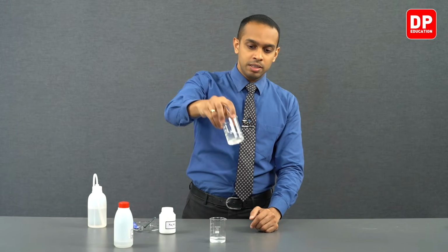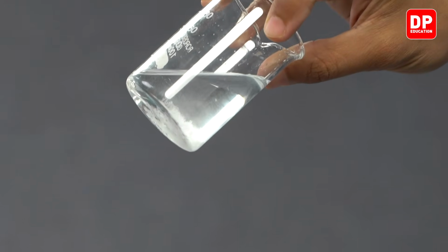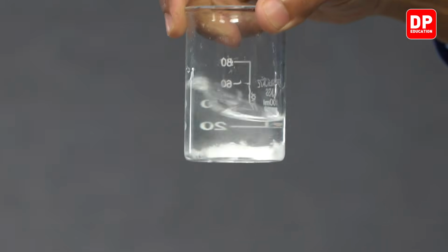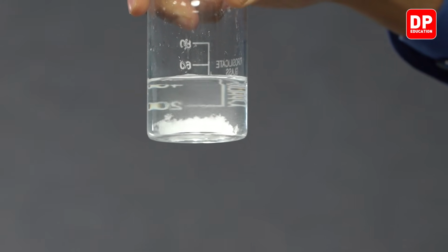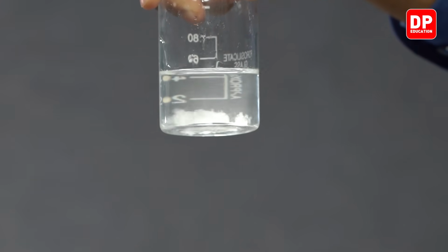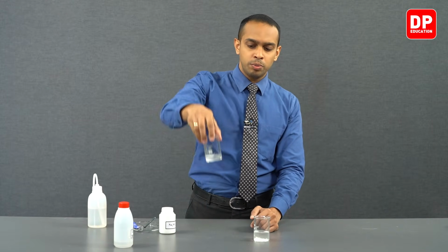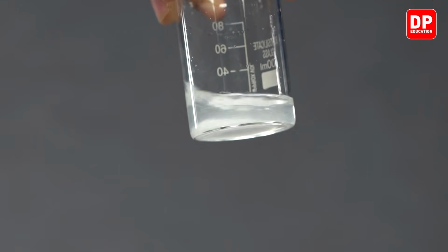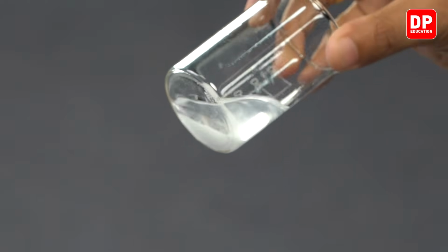However, in water, you can very clearly see the clumps that are observed here. It is not present as a powder. When you mix it, you can very clearly see it is not present as a powder. It is present as one big clump of sodium sulfate. When it comes to methanol, it is not present as a clump. You can see the sodium sulfate is present as a powder.